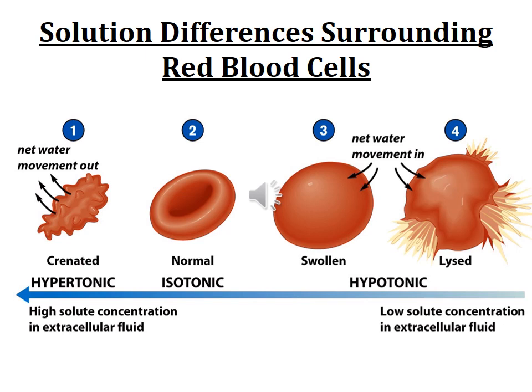Okay, by osmosis. So all we're talking about here, guys, is osmosis, both in the case of hypertonic and hypotonic. So in hypotonic, water will move from the outside to the inside, and you can guess what will happen. This will lyse the cell. This will rupture the cell, meaning it will break the cell open, and the cell content will be released into the solution. One of this cell content is the hemoglobin.